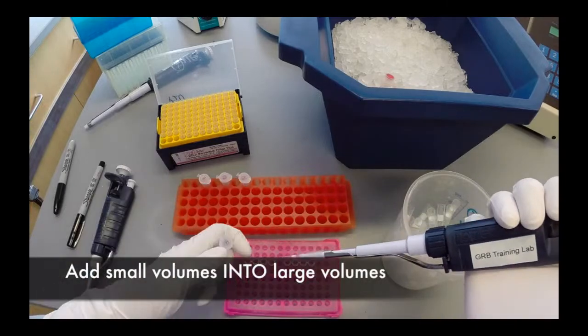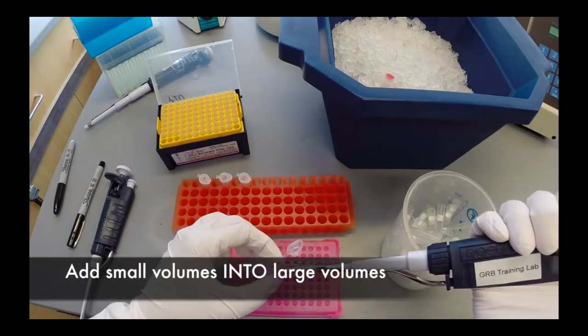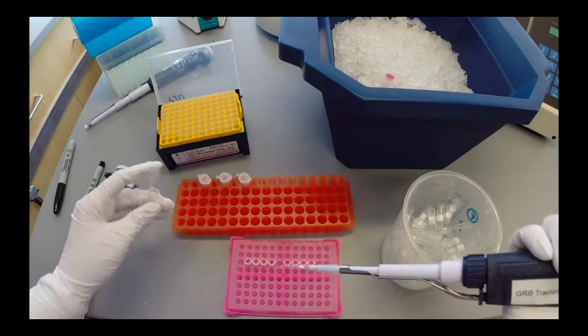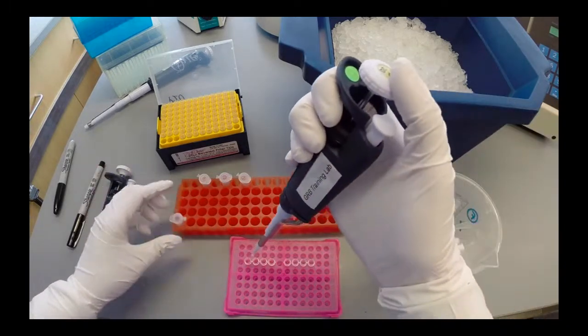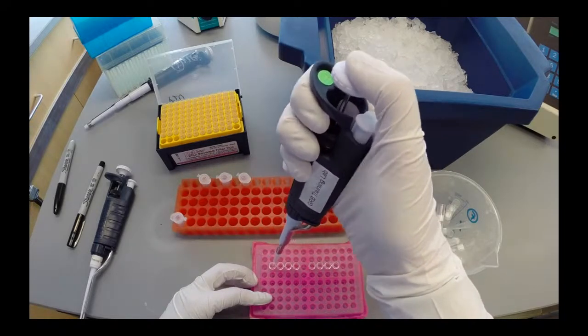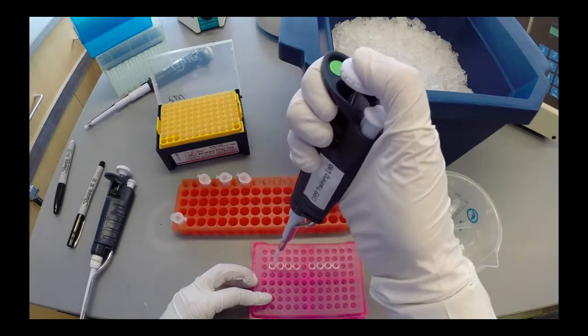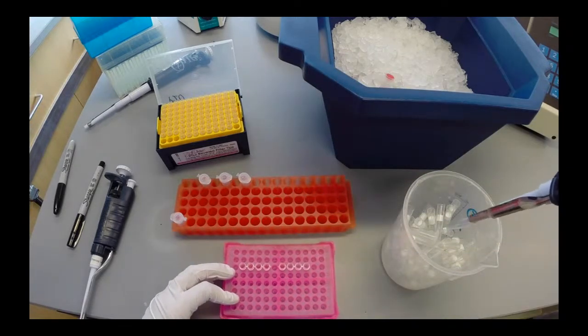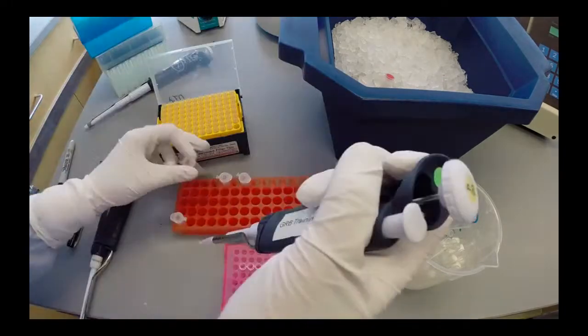One microliter is a very small volume, but you should still be able to see a drop in the tip. Put the tip all the way into the bottom of the tube and pump up and down on the plunger before expelling to the second stop. This helps to ensure that the 1 microliter of DNA has been expelled into the reaction.